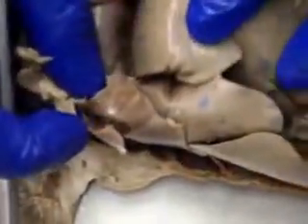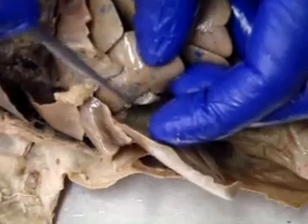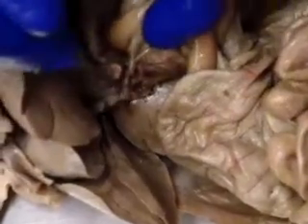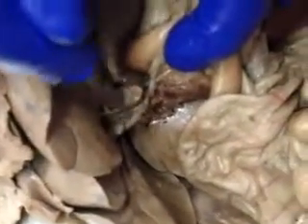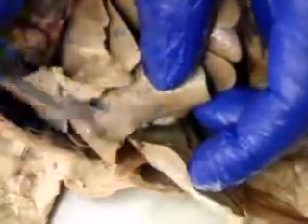So we see this large organ right here. This large organ is the liver. And so around on one side of the liver, if I pull that out there, you're seeing right there is the gallbladder. So if we follow the gallbladder, it's going to come down through here, and then right there we find the common bile duct right there. So going back to the gallbladder here, there's the gallbladder.